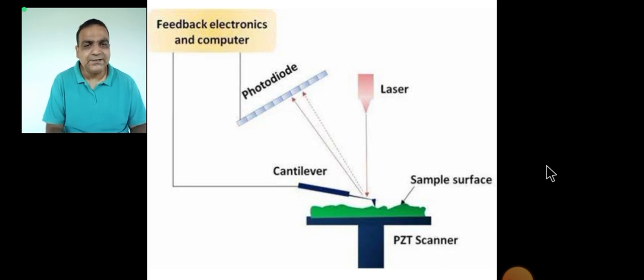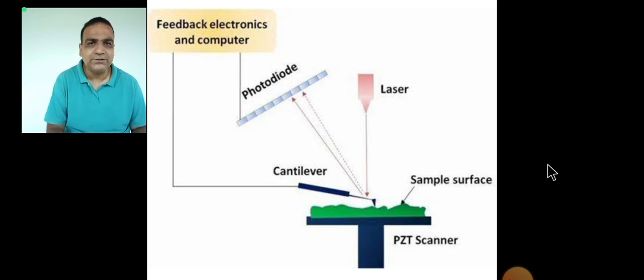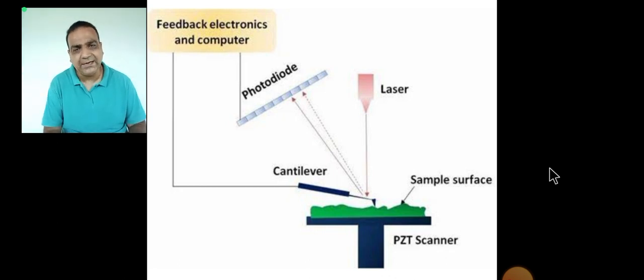Its importance is ranging all from organic matter to inorganic matter. The range of examinations are out there, and people are coming up with better technology so that we can observe the morphologies, the surfaces, and can analyze the very basic nature of atoms and molecules at very small scales.